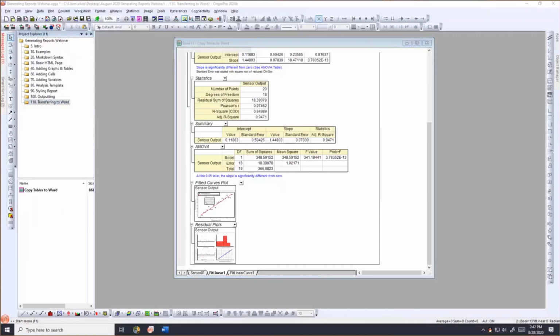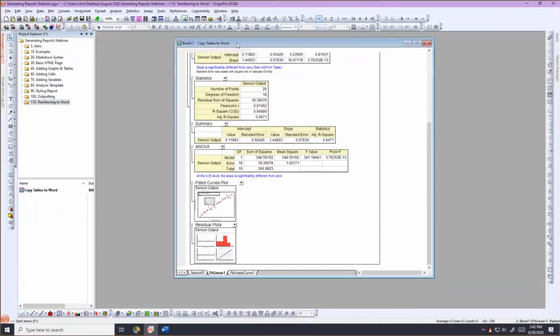How does it handle pagination in the PDF output? Can you push a report to OneNote? Here's a couple things. One, the pagination is going to depend on the printer, I think. I know you can handle page breaks and pagination via cascading style sheets, and I think that's supported okay. I think I tested that a couple years ago. But the pagination, by and large, with page numbers, is also handled by the printer of the browser.